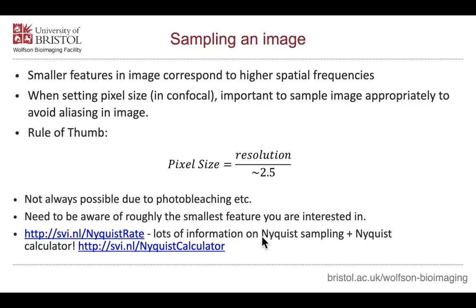In terms of calculating the Nyquist rate and Nyquist sampling, I'll direct you to these websites by the SVI guys who make Huygens deconvolution software. Some information on what the Nyquist rate actually is, how it's calculated, and then a really handy Nyquist calculator. They've even got it as an app if you want, so you can download the app and calculate your Nyquist rates wherever you are, anywhere in the world. Lovely.